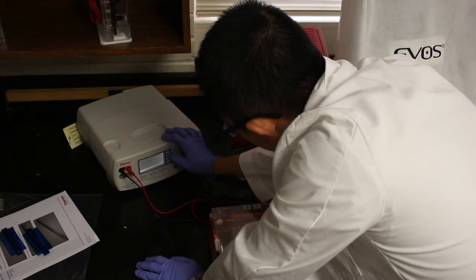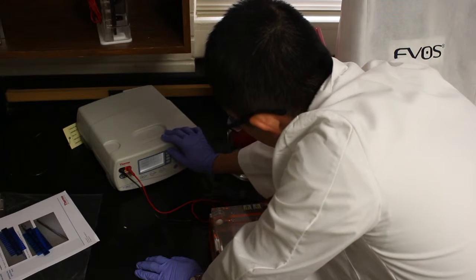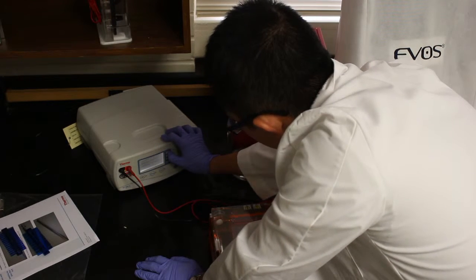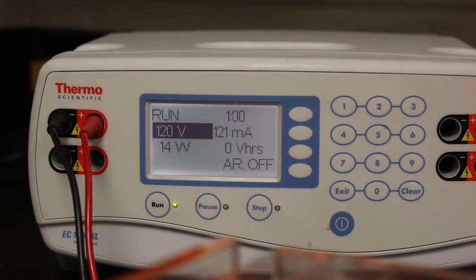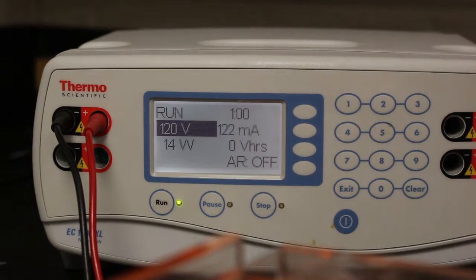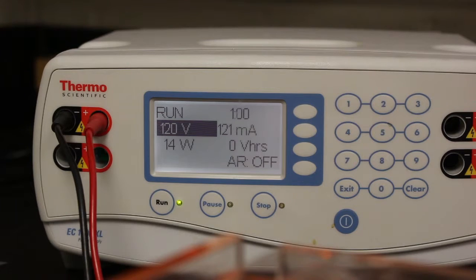Turn on the power source and allow the gel to run. This particular gel was run at 120 volts for one hour. Lower voltages will slow down the diffusion of samples. Longer periods of time will extend the distance covered by those same samples.